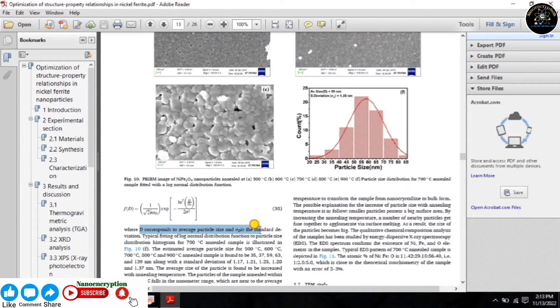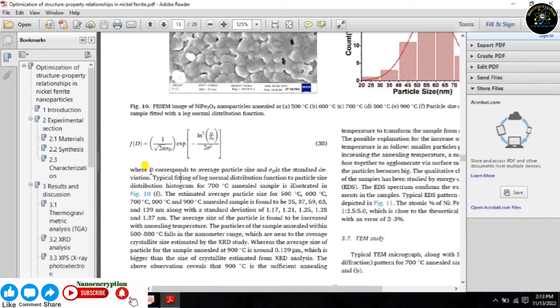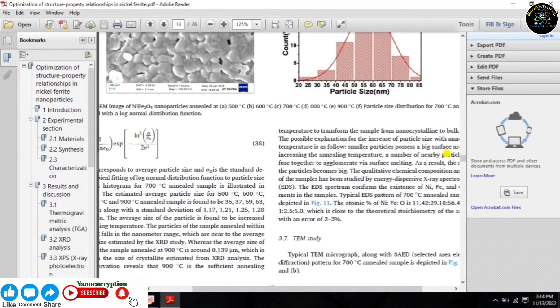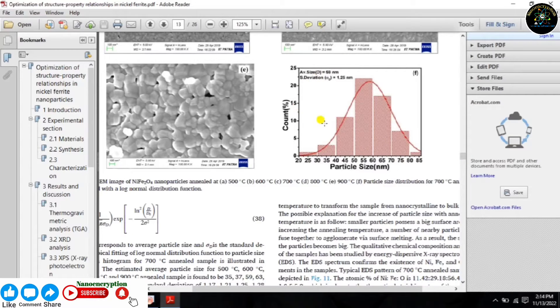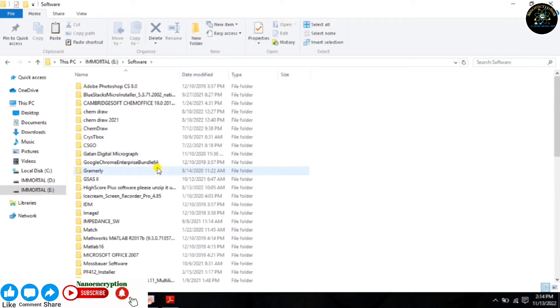For the reference, I have followed this article. Therefore, if you also want to do this, just go through the article. This is the log normal distribution function, and it is already built up in the Origin software. I have just gone through the log normal distribution function.